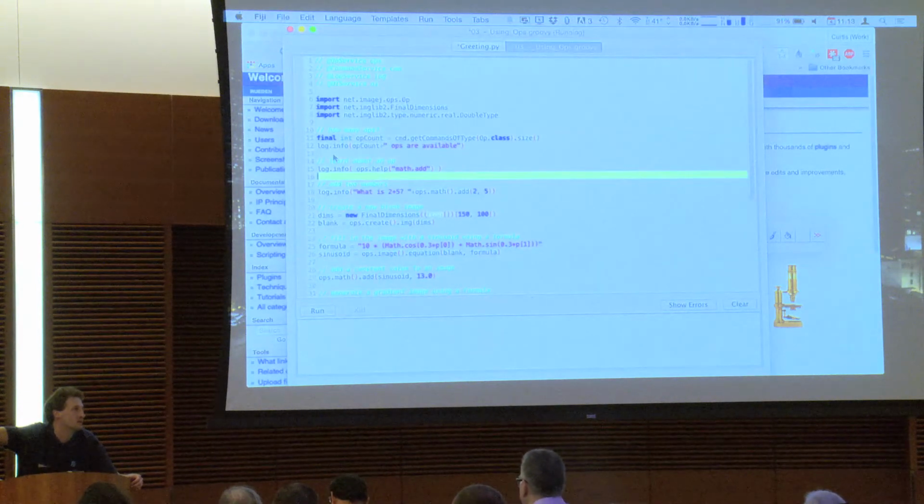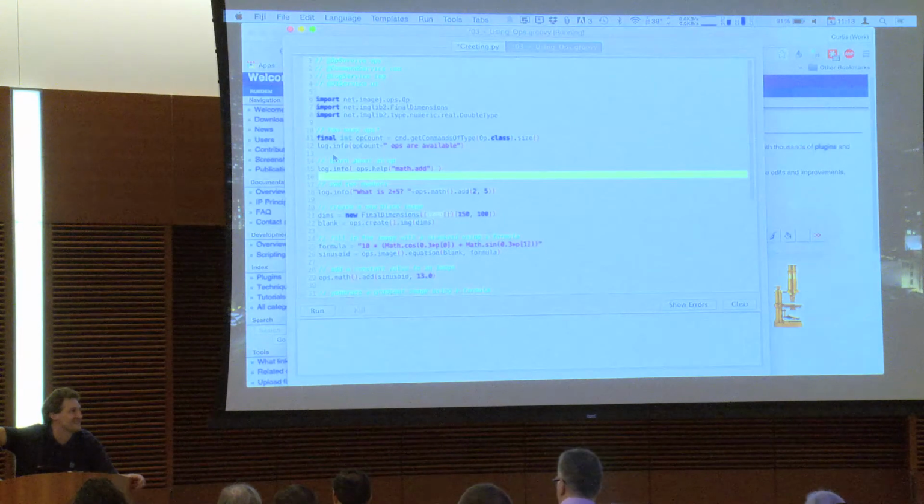Yeah, I'm kind of torn on whether we should allow for those ops, if we should say, well, seed is optional, and if you don't give it, it's random, whatever. But that strikes me as a really bad precedent. I'd like to keep ops deterministic.